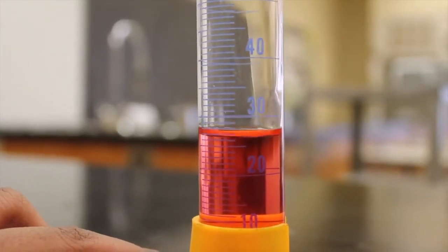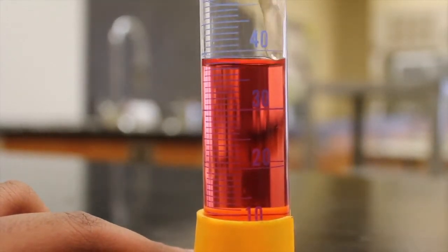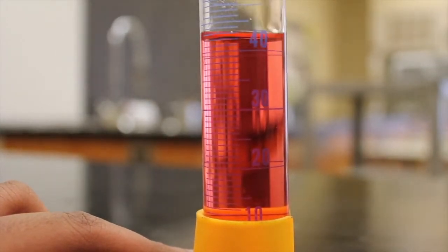Mixing chemicals should only be done after permission from your teacher is given. It is very dangerous; therefore, before mixing, read and reread labels to ensure you have the appropriate chemicals.